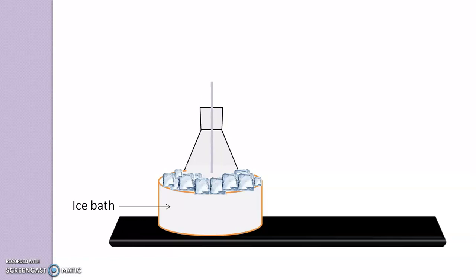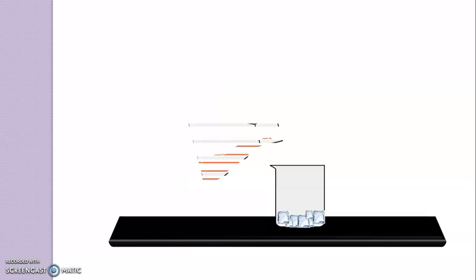After that, you have to pour these contents of the flask in a beaker containing ice. You have to stir it vigorously so there is a formation of crude 7-Hydroxy-4-Methyl-Coumarin which soon separates out.